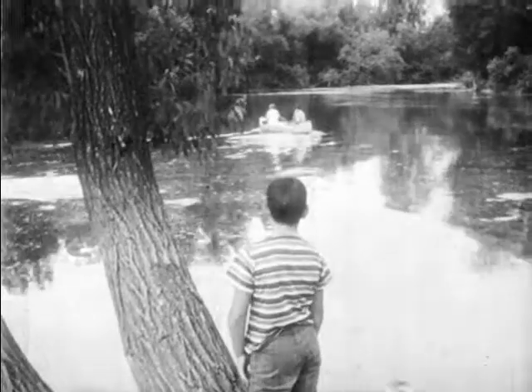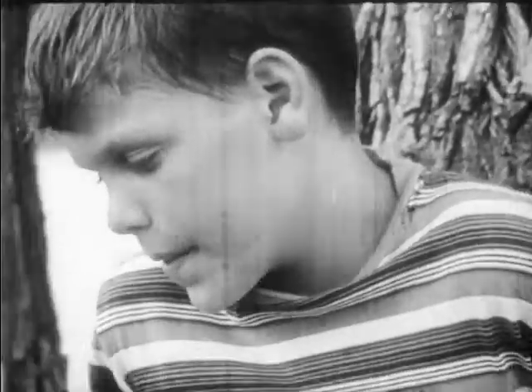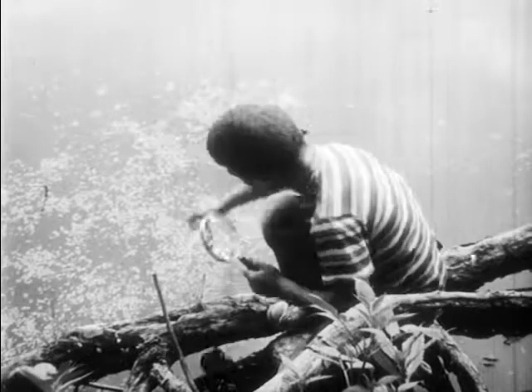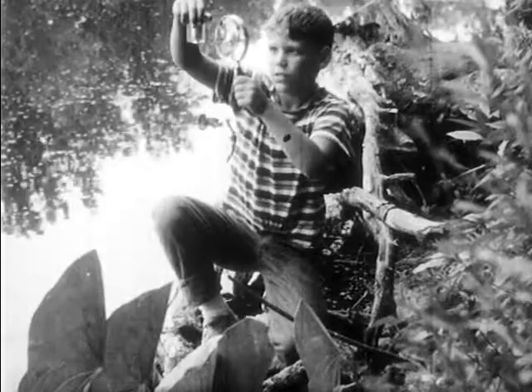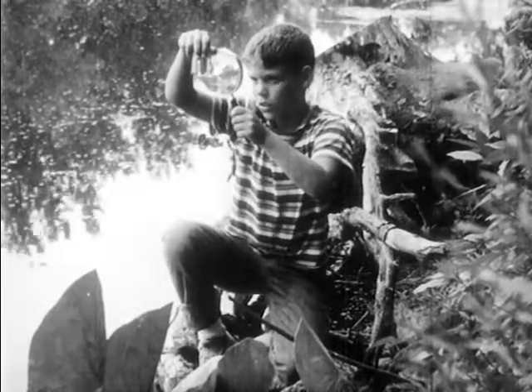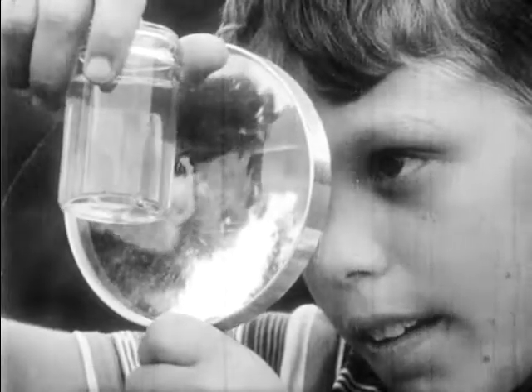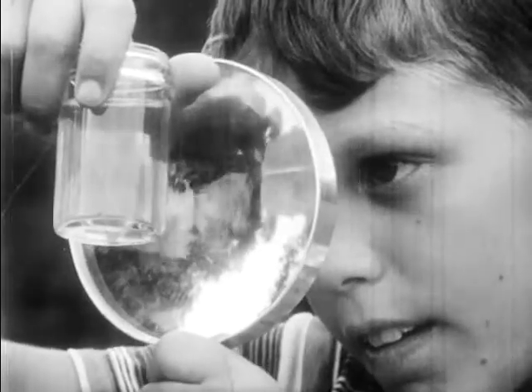But is it? Closely. Living things are everywhere. Let's investigate this water. Is there anything in it? What are these white dots?